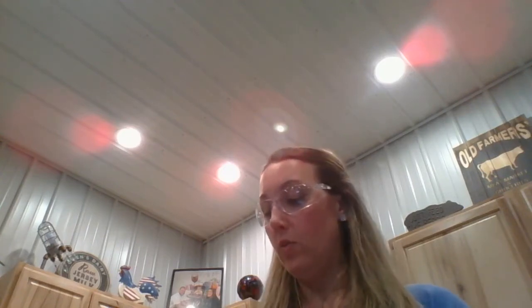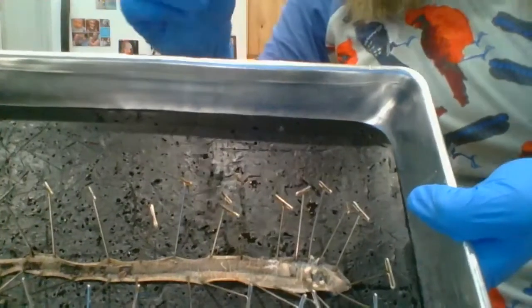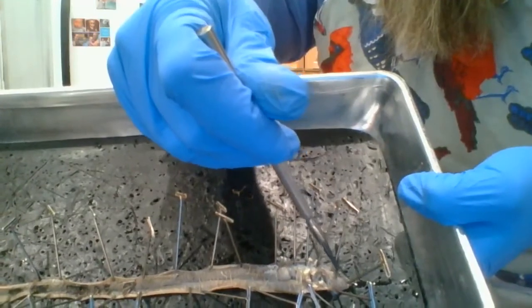All right, we're going to take a look here so I can show you what each of those pieces looks like, and I will also give you some other, more colorful pictures than this bland-looking worm. All right, so here is the mouth, and then this here is the pharynx, which is that muscle.